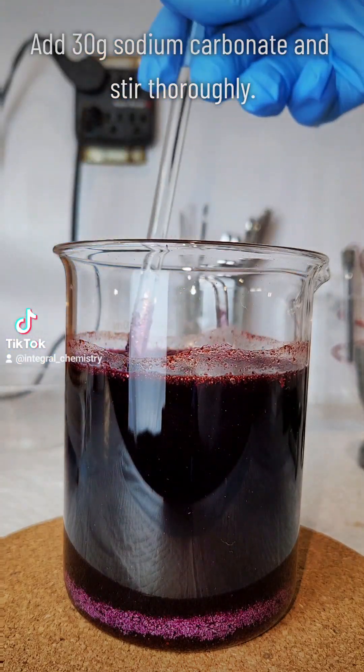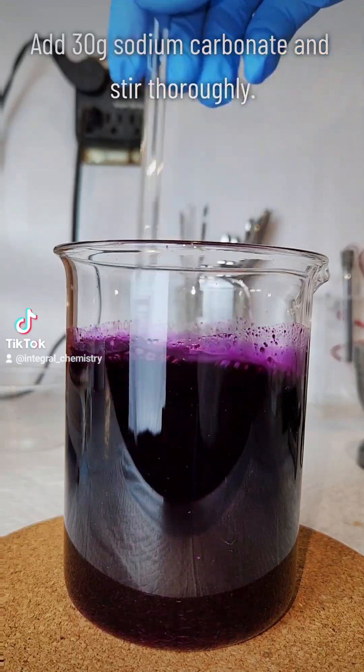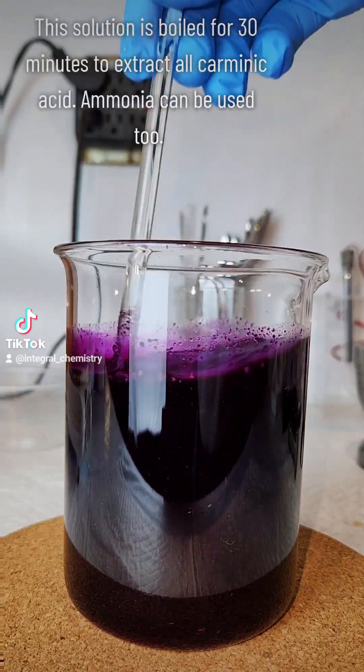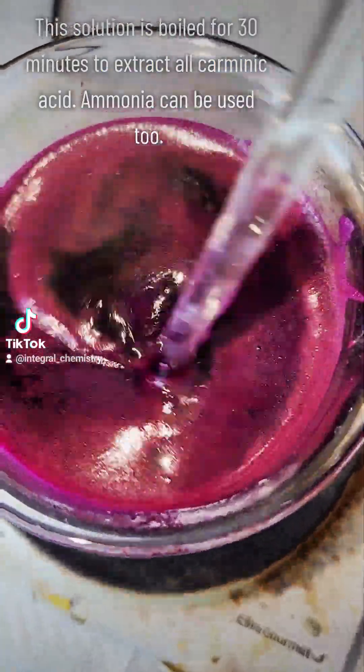Next I'm going to add 30 grams of sodium carbonate and stir that in thoroughly as well. The now alkaline bug slurry is going to be boiled for 30 minutes, which is going to extract most of the carminic acid.